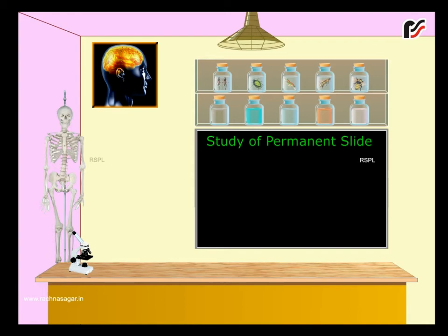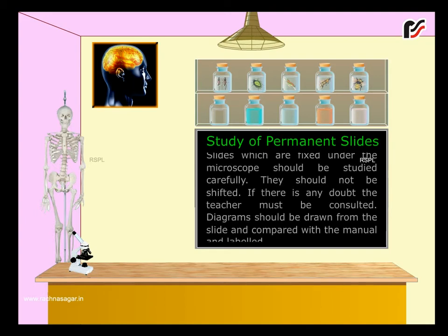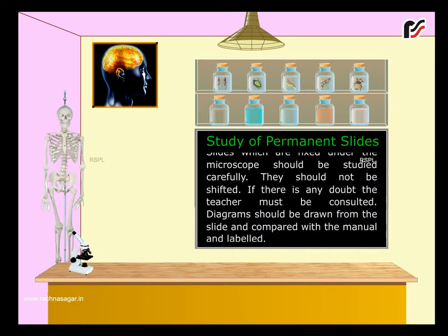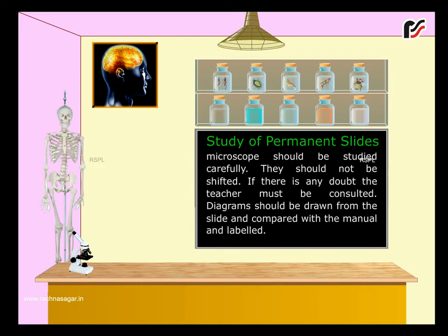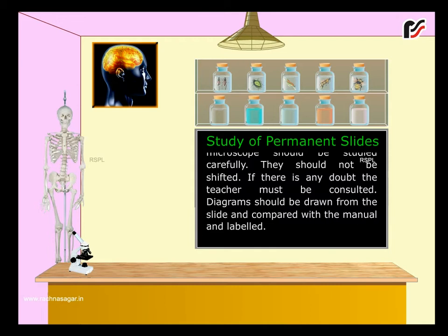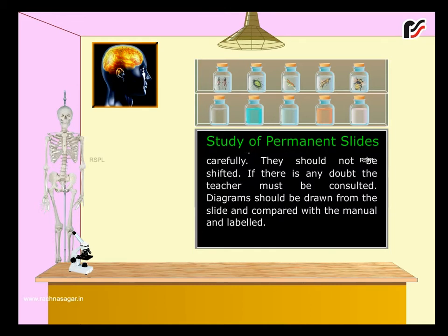Study of permanent slides. Slides which are fixed under the microscope should be studied carefully. They should not be shifted. If there is any doubt, the teacher must be consulted. Diagrams should be drawn from the slide and compared with the manual and labeled.